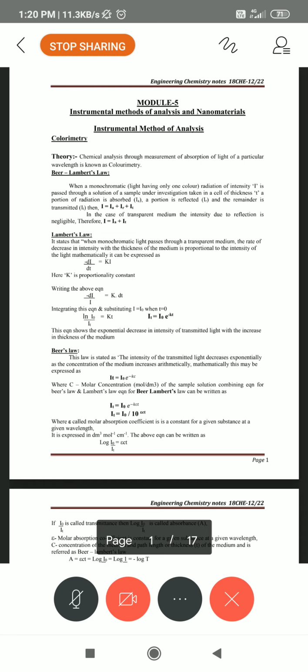To the first you add 2 ml of sodium fluoride, to the second 4 ml, to the third 6 ml, to the fourth 8 ml, and to the fifth 10 ml. Next, to all of them you add 10 ml of Spadns reagent. It is common to all.